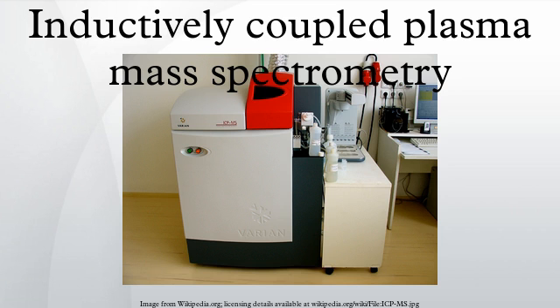Many varieties of nebulizers have been coupled to ICP-MS, including pneumatic, cross-flow, Babington, ultrasonic, and desolvating types. The aerosol generated is often treated to limit it to only the smallest droplets, commonly by means of a double-pass or cyclonic spray chamber. Use of autosamplers makes this easier and faster.